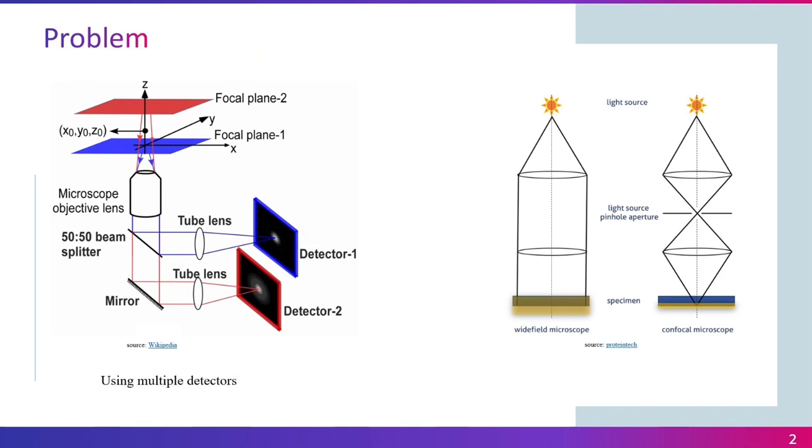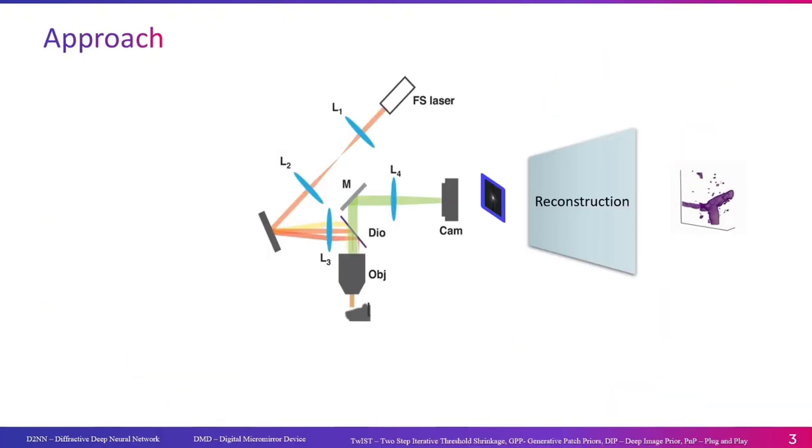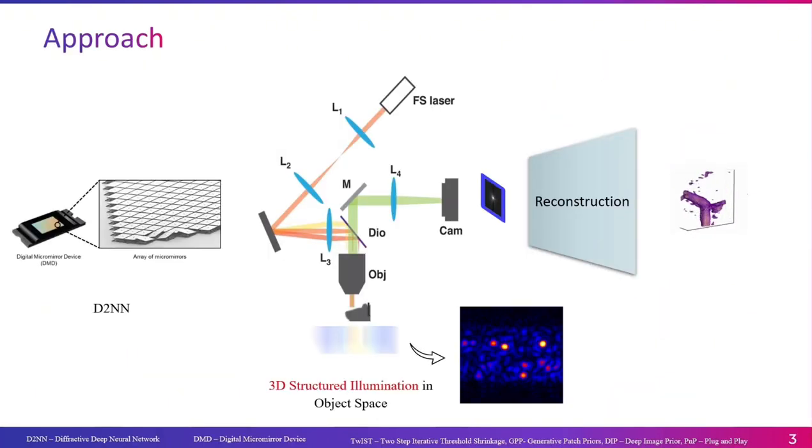Additionally, large datasets strain storage and management, while detector limitations affect imaging resolution and fidelity. Innovative solutions in instrumentation, computation, and data management are essential to improve 3D imaging in science and medicine. This gives us the overall approach of our project.